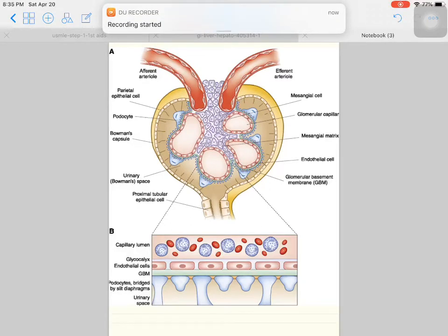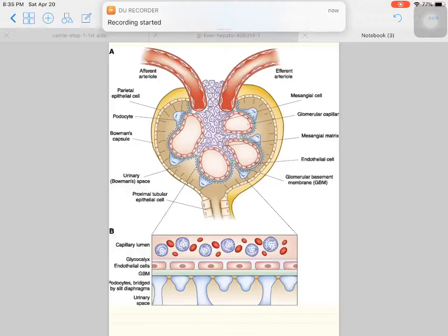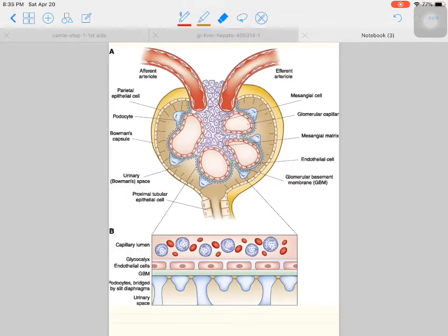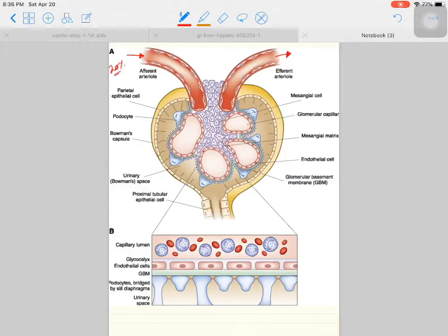Today we are going to discuss the structure of the glomerulus. The kidney comprises parenchymal cells and nephrons, which are the functional and structural units. Here we have the glomerulus with an entry point and an exit point. About 20% of blood goes to the kidney from systemic circulation. The small arteriole through which blood enters is called the afferent arteriole, and after that it divides into different small capillaries called glomerular capillaries.